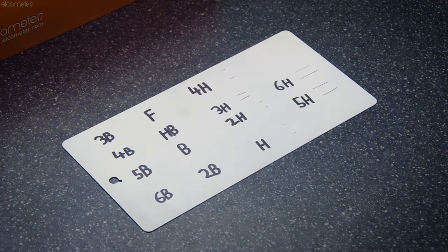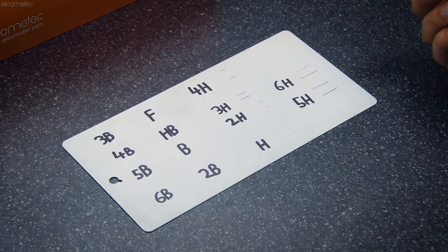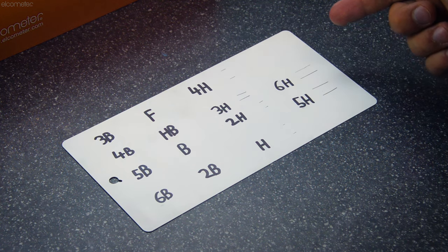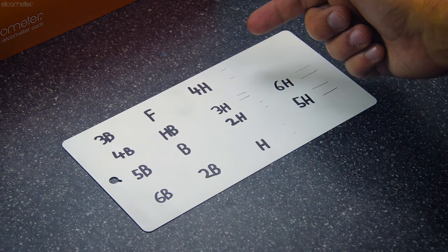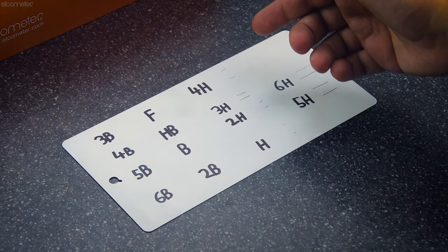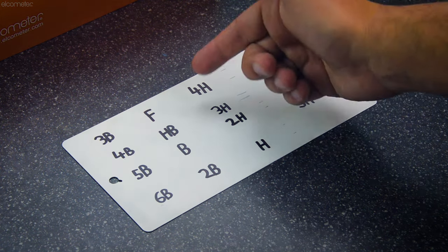Looking at this test panel, which has results from 6B (soft) all the way through to 6H (hard), working down from the hardest pencil, the hardest pencil to make a scratch less than three millimeters long is H — so this is the gouge hardness, as all scratches made by harder pencils are over three millimeters in length. As for the scratch hardness, continuing from hardest to softest to find the hardest pencil that leaves no marking at all, the result is F.